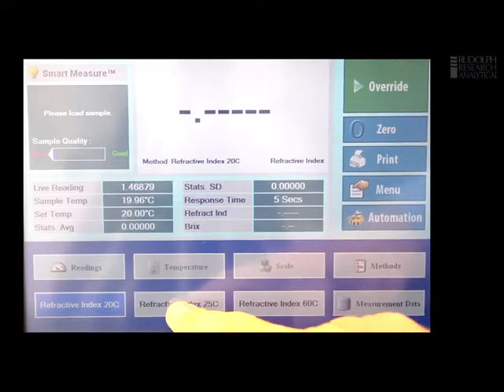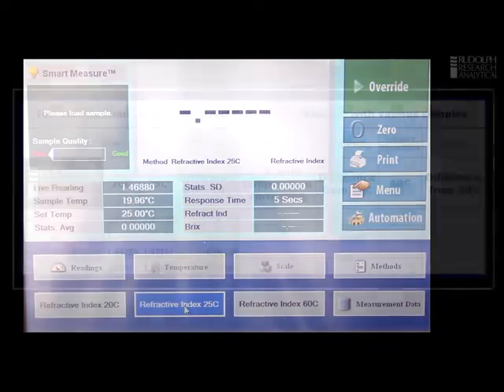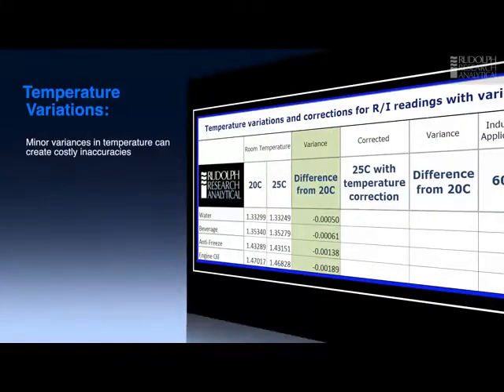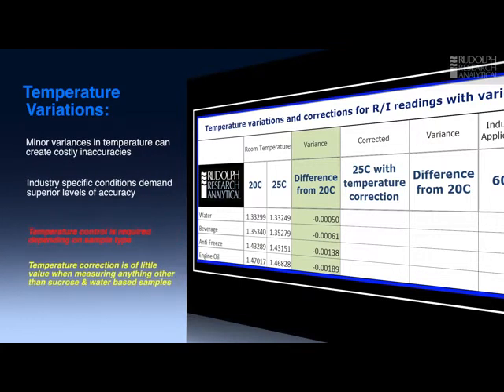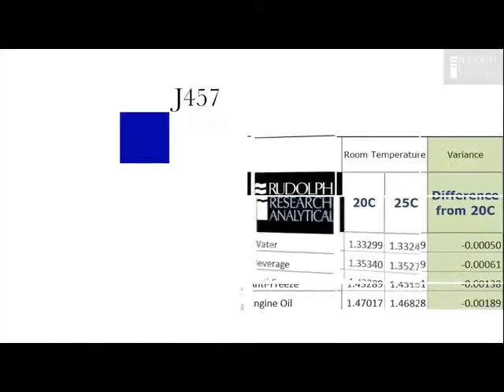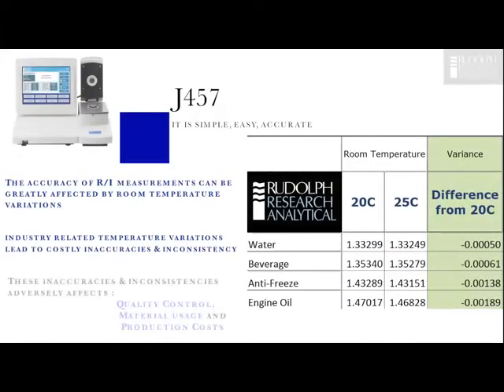My next step will be to set the instrument for 25 degrees and repeat the process. Very commonly people measure at room temperature, but what is room temperature? 20 to 25 degrees is probably a reasonable variation in a normal air-conditioned room. So let's see what effect that variation has.